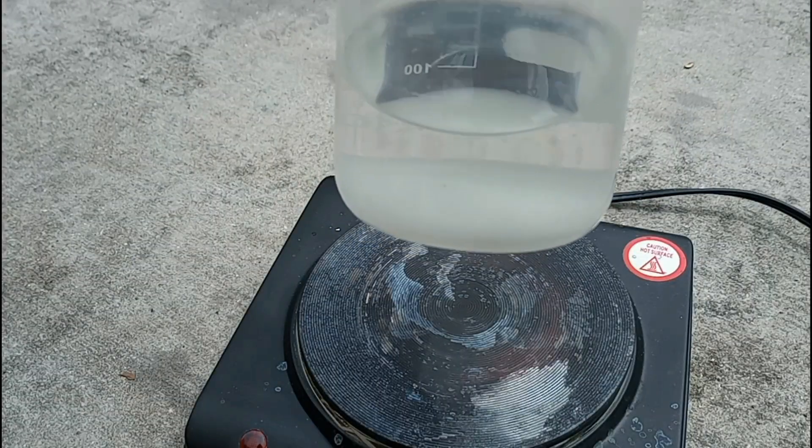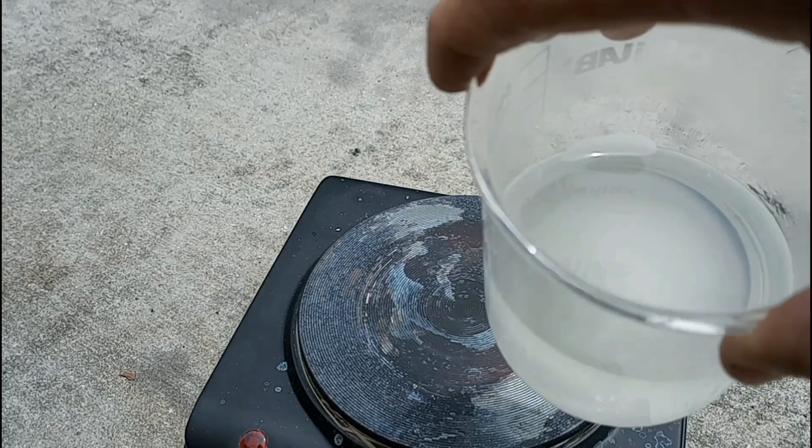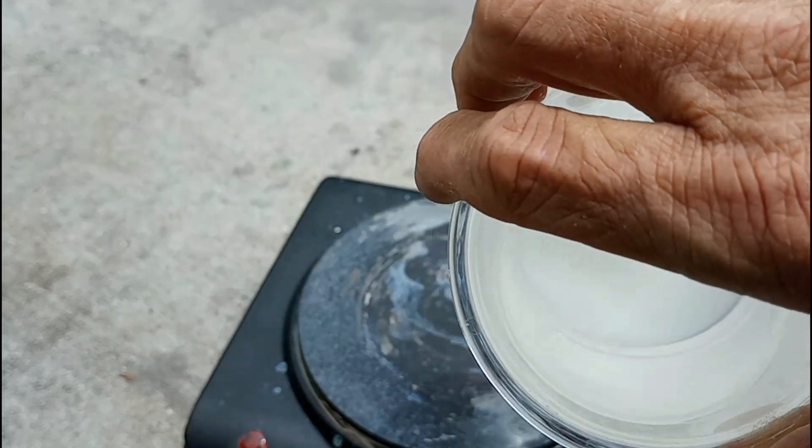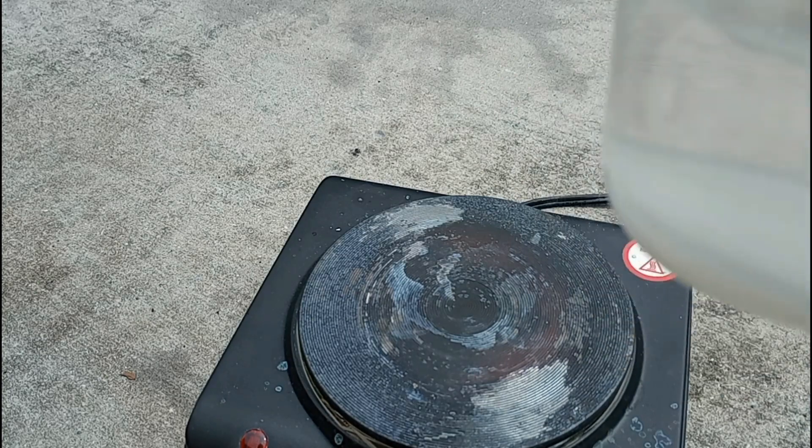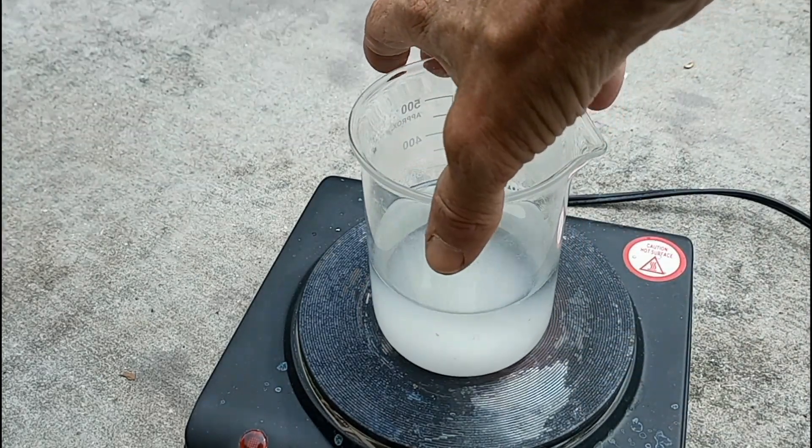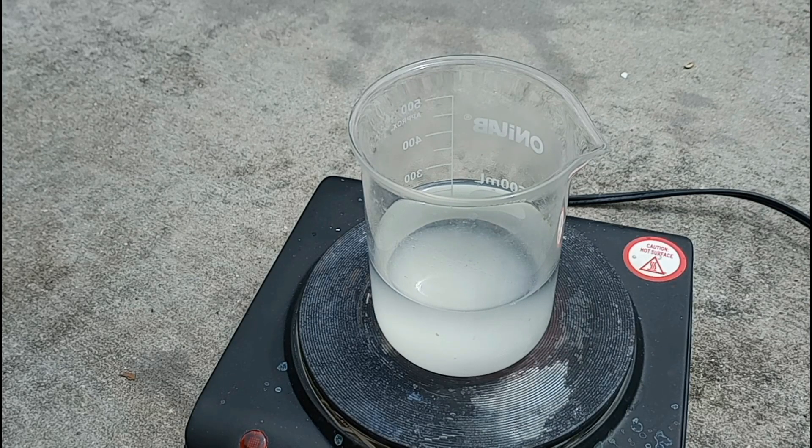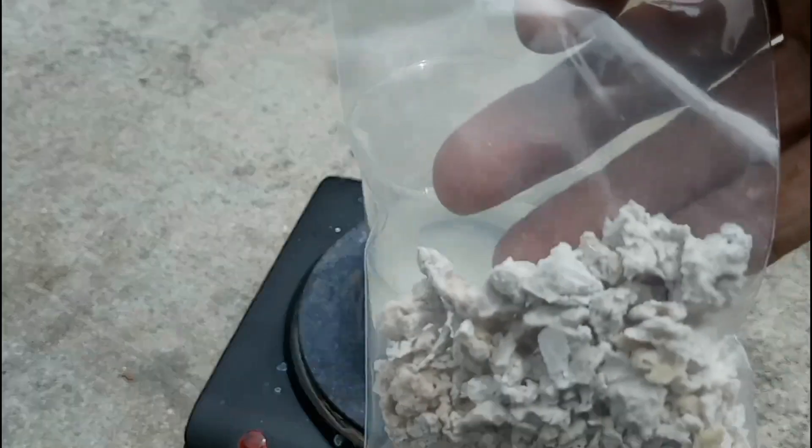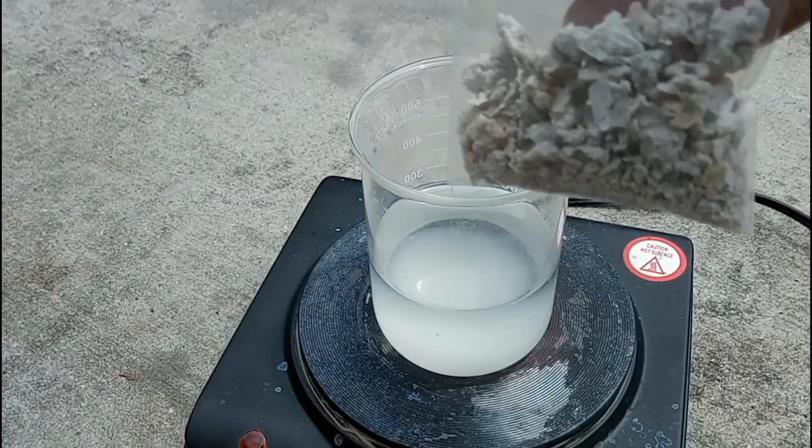So the beaker did clean up relatively easy, and here's the wash water from it. Now, interestingly enough, it didn't all dissolve. It left behind this white powdery substance. And this is just from the wash water. This is the solids that we pulled off.